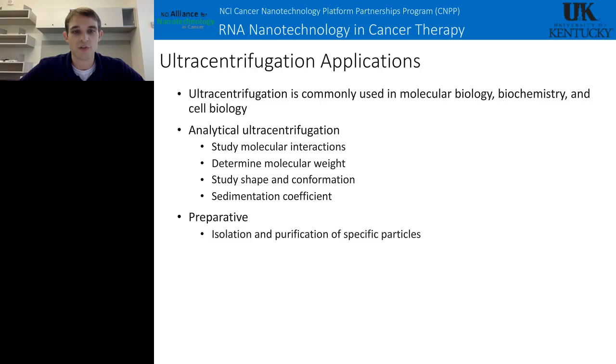Analytical ultracentrifugation is used mainly to actually study your molecule, whether that be molecular interactions such as RNA-protein interactions. You can also study the physical properties of the particle, such as molecular weight, its shape and conformation. Using all this, you can determine its sedimentation coefficient, which also relates to the molecular weight, shape, and conformation. But the method I will be focusing on in this webinar today is preparative ultracentrifugation, mainly isolating and purifying specific particles. In this case, that particle will be RNA.